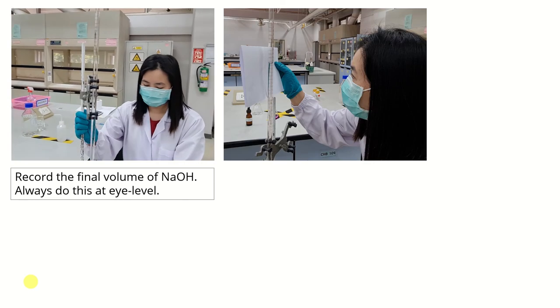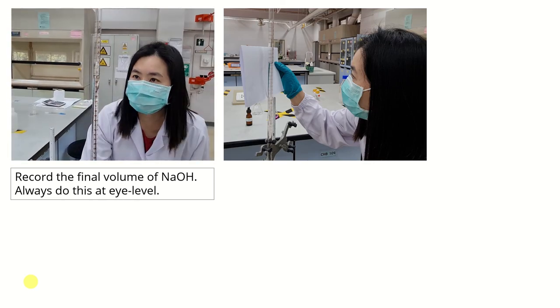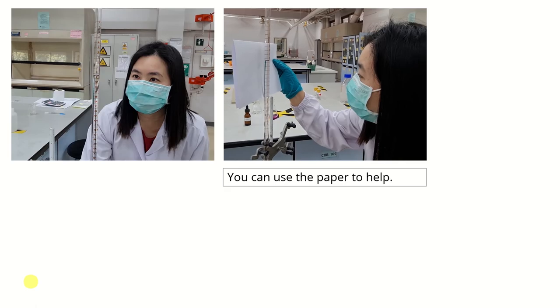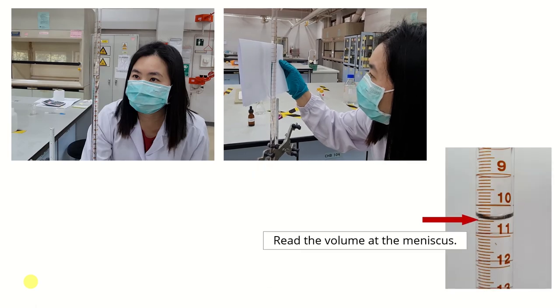Next, you record the final volume of sodium hydroxide. Again, if you are not tall, bring it down, or sit on a chair. You may use paper to help read the volume at the meniscus. Record this final volume into your report.